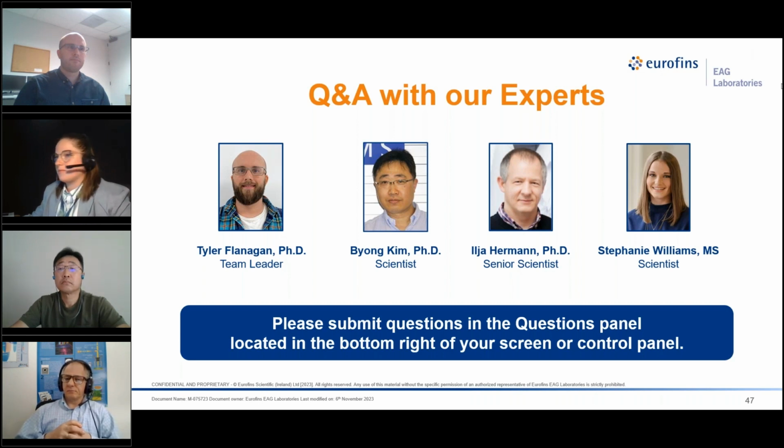Great, thank you. And this was a question that was brought up while Tyler was presenting, but if this is not an optical profilometry answer, then feel free to chime in. It says, which method is the best to measure microcracks on polymer thin films after a fatigue test? So you definitely use profilometry to measure that, either optical or stylus. Ilya covered fracture toughness. Unless you're doing really small cracks, then sometimes you'll need atomic force microscopy. But in general, you can get it done with profilometry.